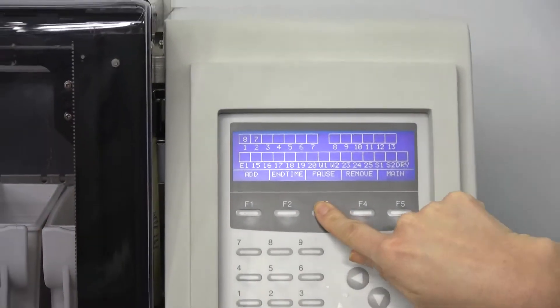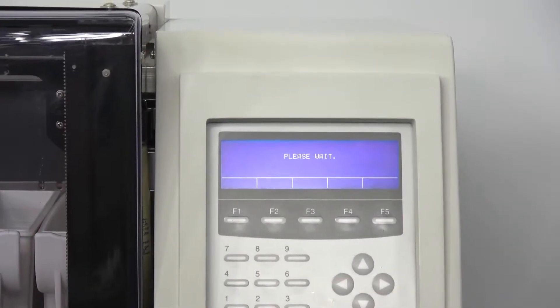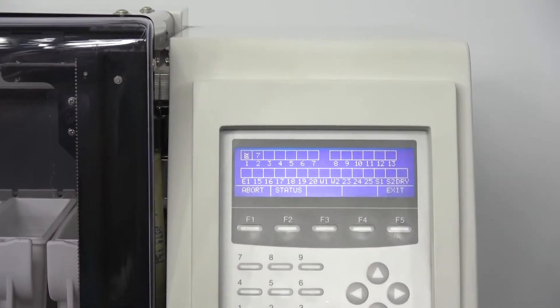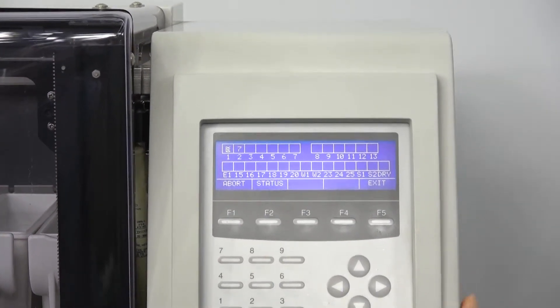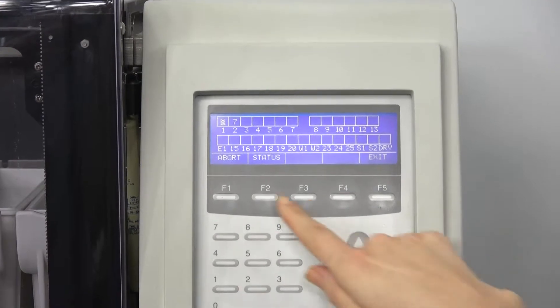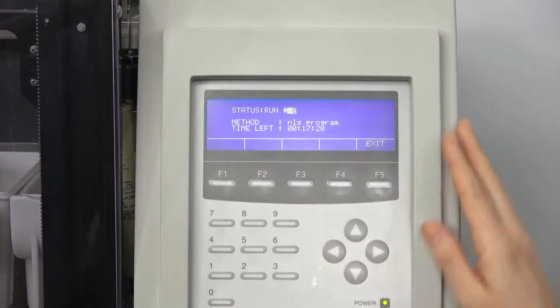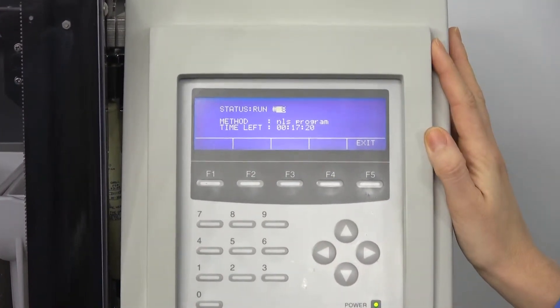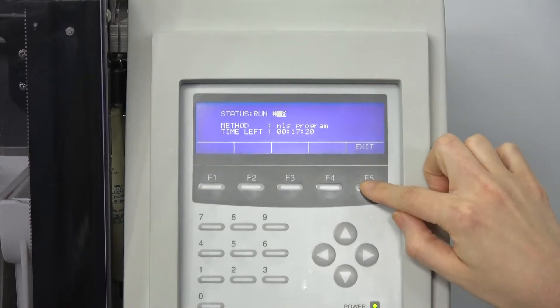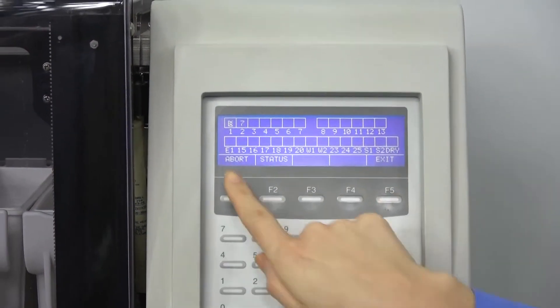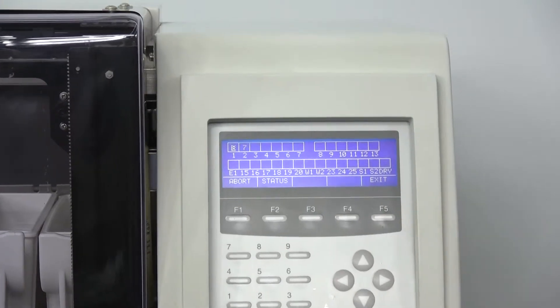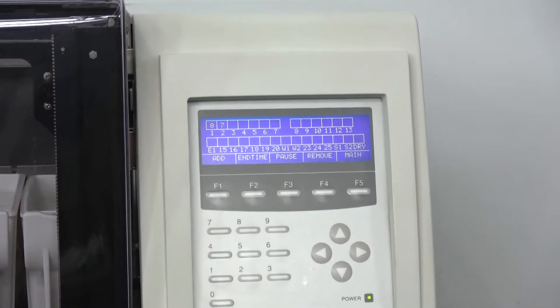And with this you can also pause your run and it'll leave your slides in that reagent. And you can see exactly how much time that you have left with this current run. And you can either abort or exit that menu and it'll restart your program.